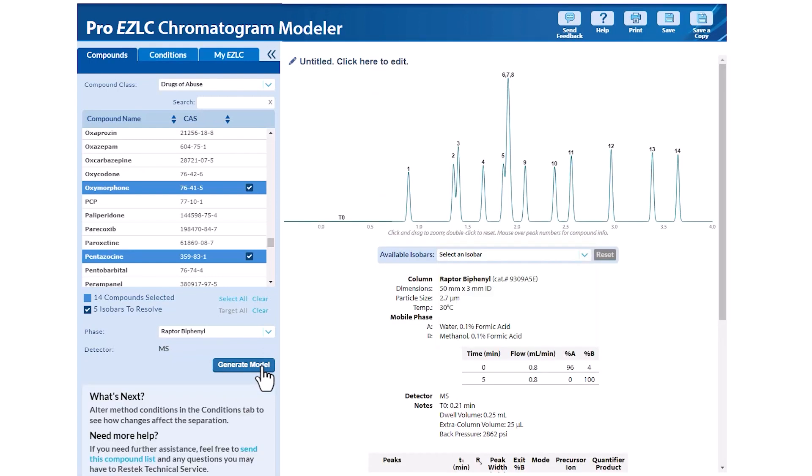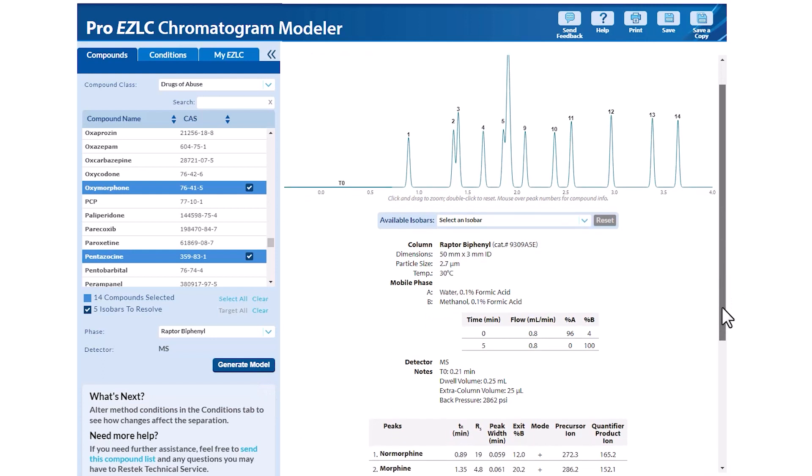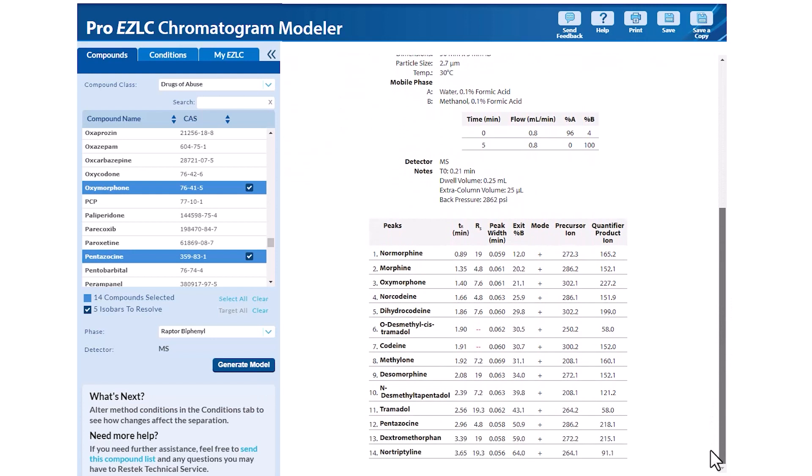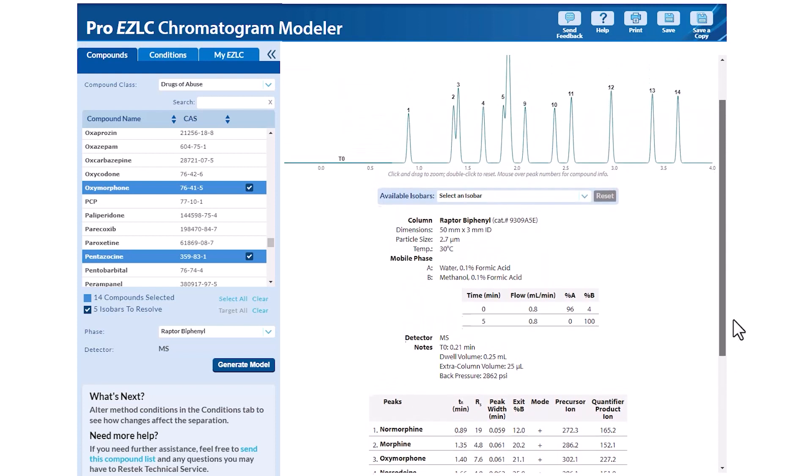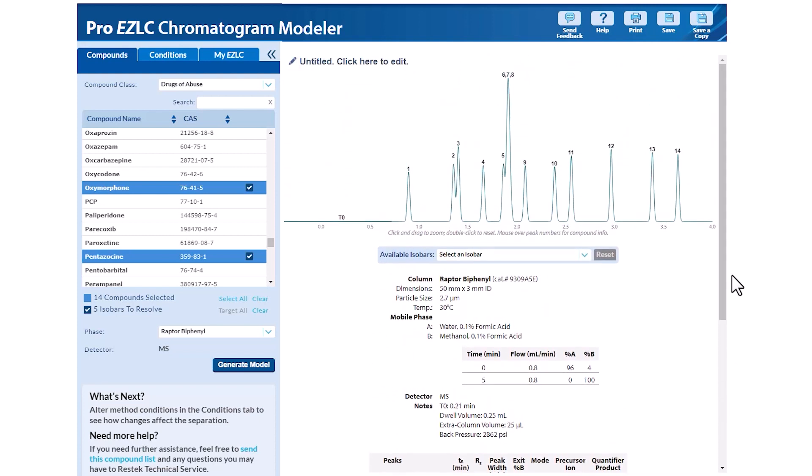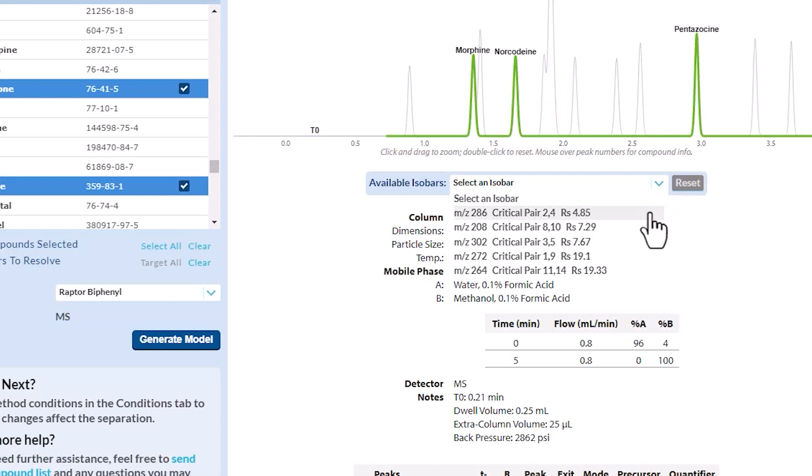An interactive, modeled chromatogram will appear on the right-hand side of the interface. Below the chromatogram are the run conditions and a table of your selected analytes. Our compound list includes five isobars which we can view in the available isobars drop-down list below the modeled chromatogram.